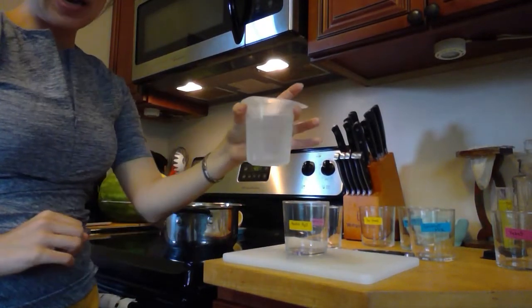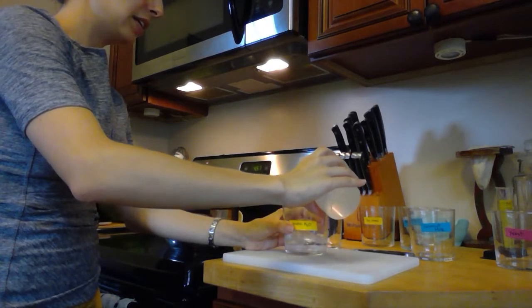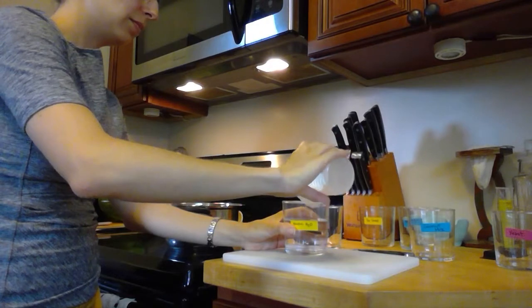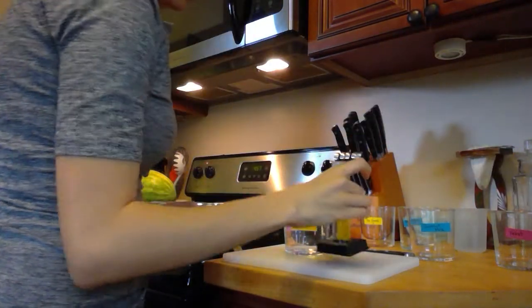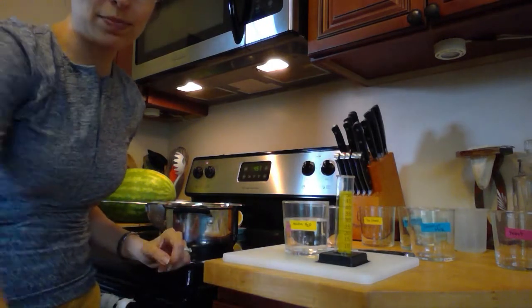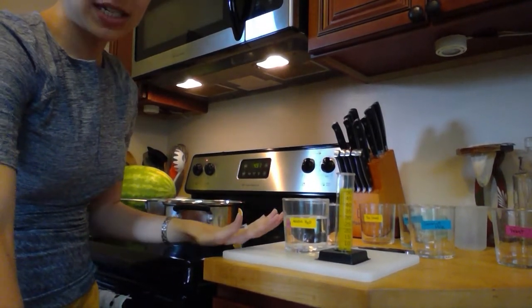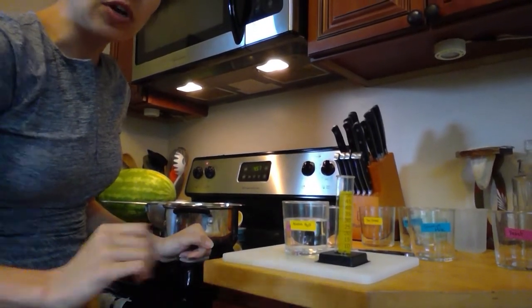Okay, I have my acidic water out of my machine. I'm going to put it in the acidic cup. There we go. And now I'm going to use this little test tube to measure out my indicator. Now, if you look at your procedure, you want 200 milliliters of whatever you're testing to go into your cup, and then you want 25 milliliters of your indicator.